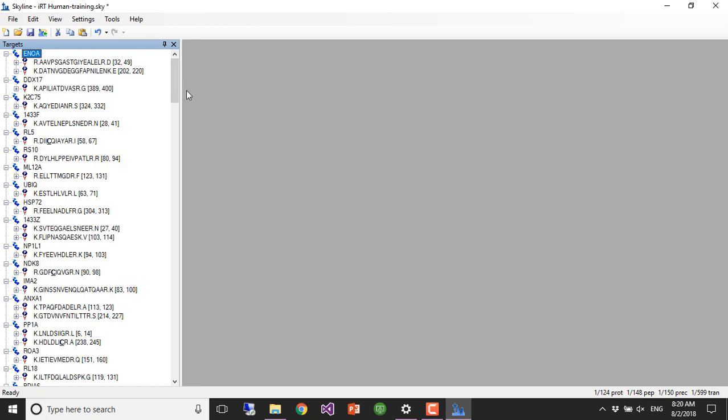So now we do need to get the iRT peptides in here. And we can either do it the way we just did it, which is let Skyline put them in. But since, as somebody just pointed out, those aren't the reference transitions, that's not what Biognosys measured. It wouldn't matter, those are perfectly good transitions, and by our measurements, the best for these standards on our systems.